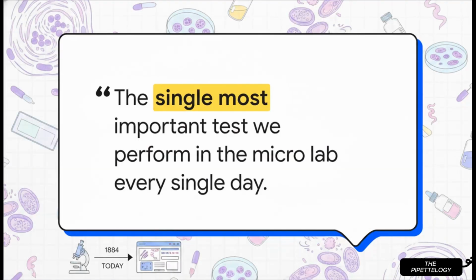And look, that is not an exaggeration at all. I mean, think about it. A procedure that's been around since 1884 is still the most critical test in a modern lab. How crazy is that? Well, there's a good reason. In just about 5 minutes, it gives doctors that first, absolutely crucial piece of the puzzle they need to start identifying and treating a bacterial infection.